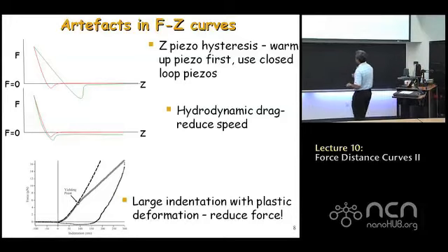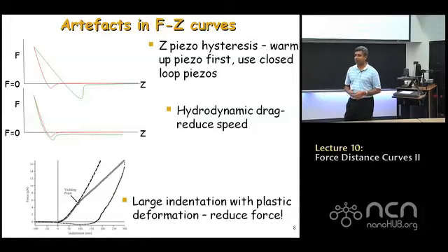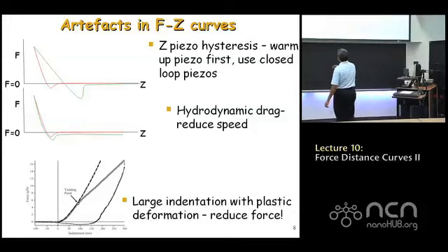One very important thing. Most people in AFM, when they start, this graph, force versus indentation, is done in volts, because many people just don't bother about converting volts into nanometers, into nanonewtons, okay? It's terrible because of the following reason. You guys need to have an idea of what are the forces you should apply in AFM. In AFM, I guess in my opinion, I'm sure Ron will agree, you never want to apply more than 100 nanonewtons of force. This is upper.